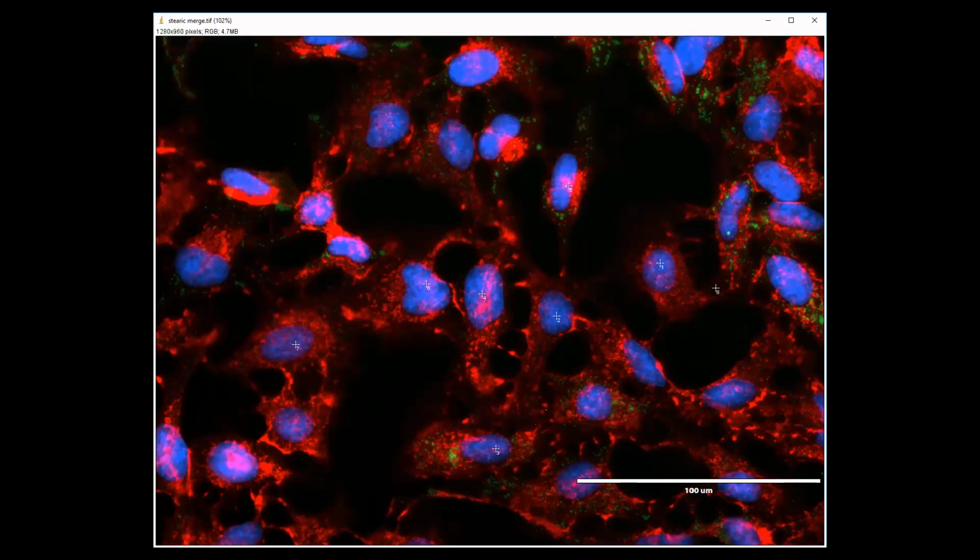When you're selecting cells, do not select cells on the edge or the periphery of this panel. And you want to select cells that have distinct puncta in them, distinct lipid droplets. If there's a big blur of them, that's going to be really hard, especially in this particular example of phenotype where you're counting the number of spots per cell. So there is going to be a little bit of a bias there, but that's just because of the limitations of what we're trying to do.